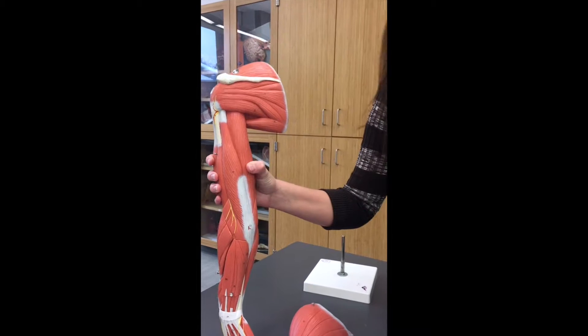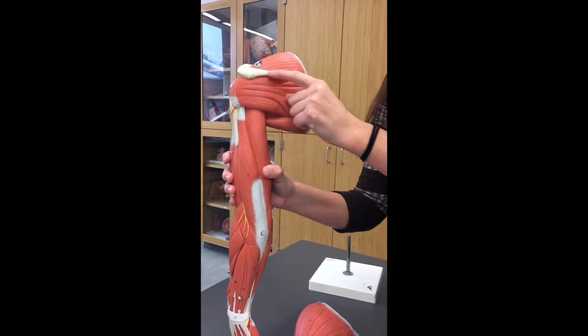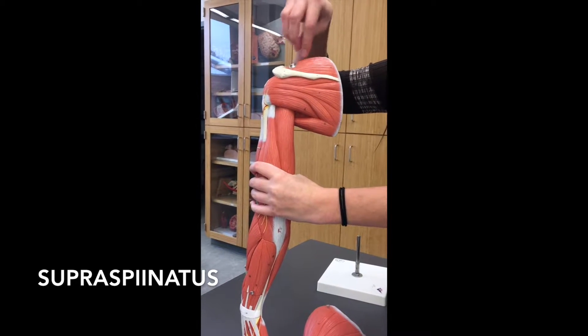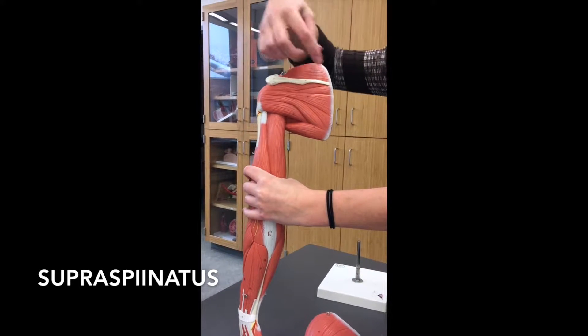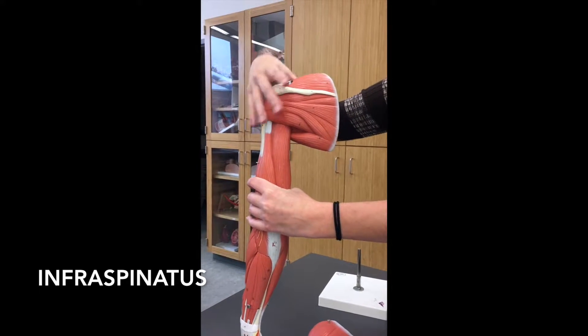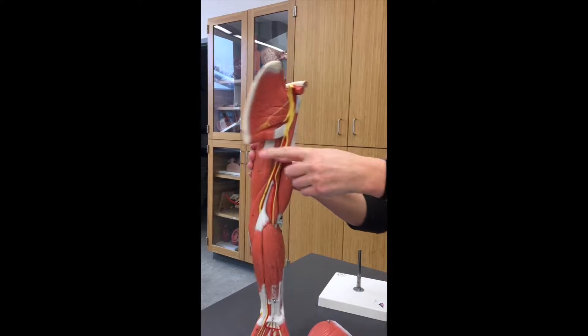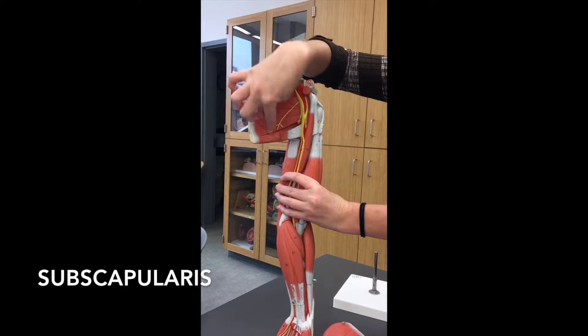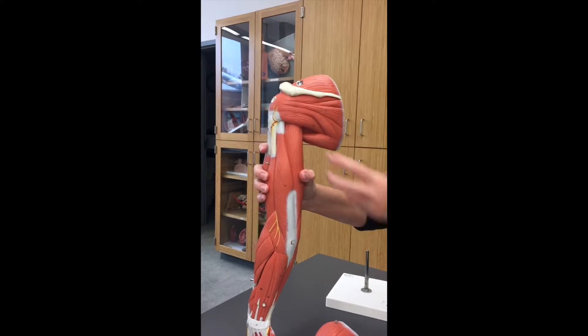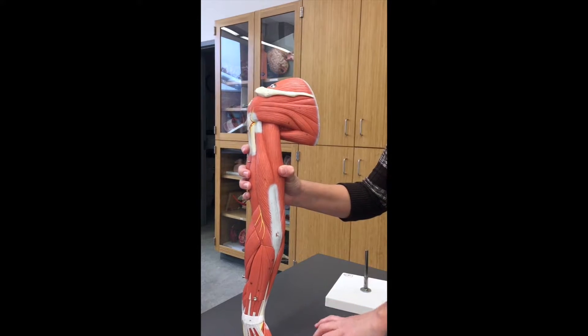This bone is the scapula. This ridge of the bone is the spine of the scapula. If we're above the spine, this would be our supraspinatus muscle, whereas if we're below the spine of the scapula, it's going to be the infraspinatus muscle. The other one that's pretty obvious: if you turn the scapula over and go on the underside, this is going to be your subscapularis. The only two up in the shoulder other than that are these two guys — they're going to be the teres muscles.